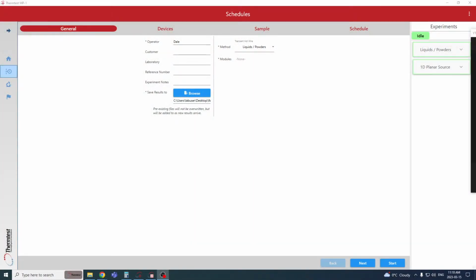This is our data acquisition software for the MP-1. We've divided the software up into two applications. The data acquisition is what controls the controller, the switches, the parameters, and the automation of those parameters. So it allows us to have a lot of power in controlling a single sensor or multiple sensors to really get the best experience and convenience out of the software.